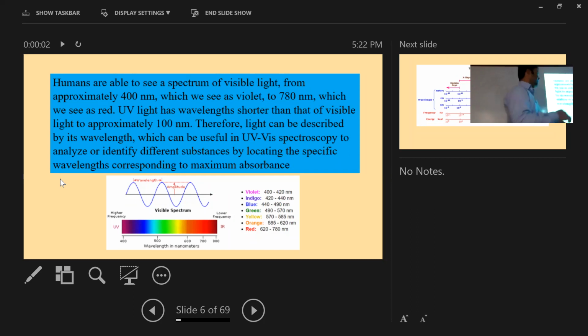And if you have a band, here you can see this is the band, with different colors. It is not as good as what I can see on my display. However, you can at least differentiate: this is yellow, this is blue, and some here a little bit dark. But actually, on my display, this portion is red. So I'm going to show you the UV visible. This side is UV, and from here we go a little bit violet, and at the end it is at 800, or red.